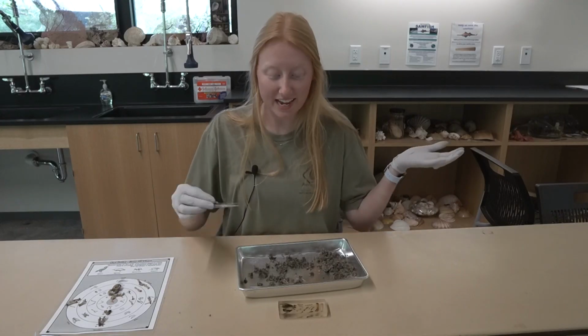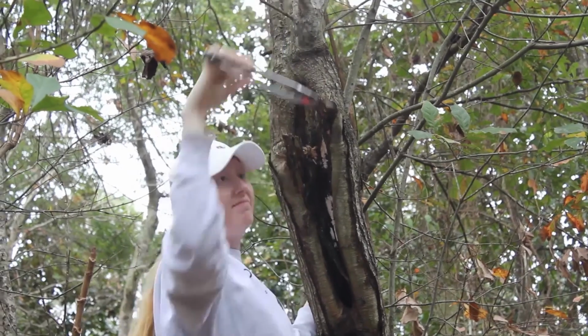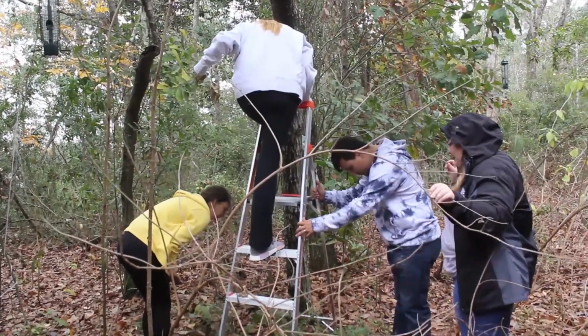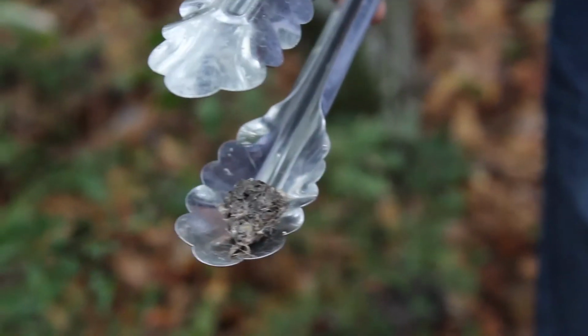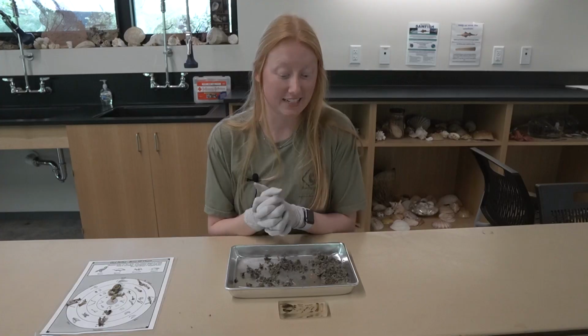That's it. So that is how you dissect an owl pellet and how an owl pellet comes to be. You can find these in the wild if you look really, really closely, or if you observe an owl for long enough, they will probably regurgitate that pellet, and then you can totally go try and find it underneath the tree that the owl is in and dissect it yourself.